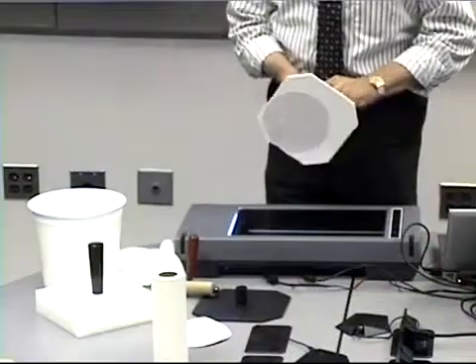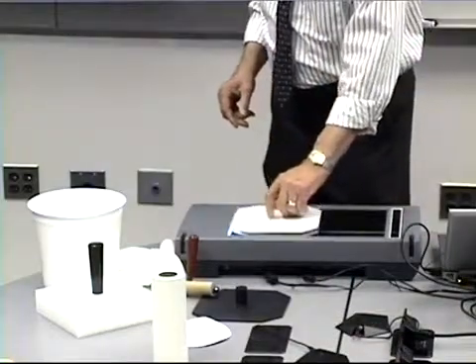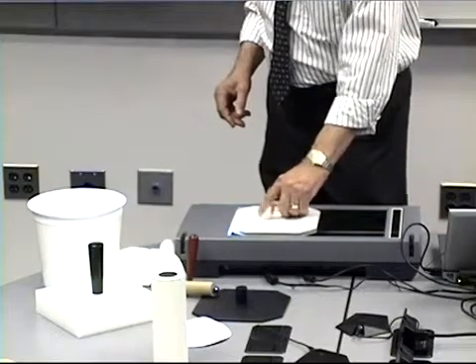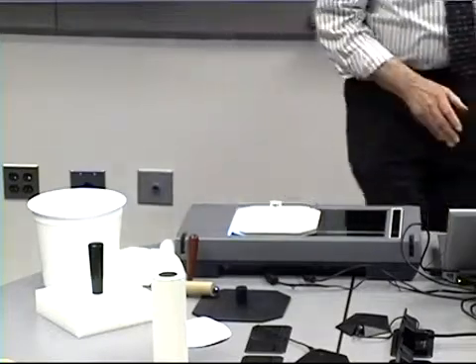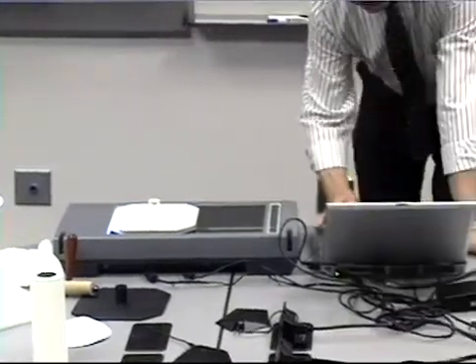This means that we can, in fact, measure all of the dirt at one time. We'll put the blotter and the hand sheet right on the scanner. Now, the scanner system has been loaded, and we will set up the test.